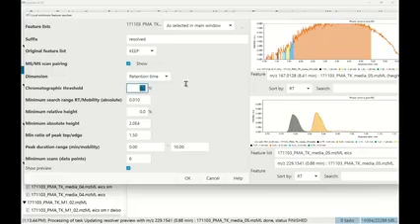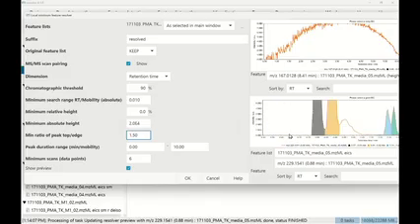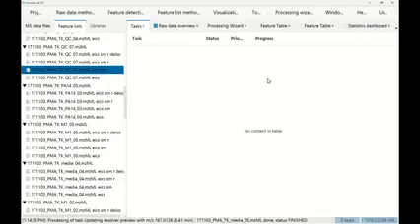And this one I did not optimize, right? So I could very easily now optimize this and basically try to get this shoulder here in, and so on. I can change some parameters and then it automatically changes everything and gives you some feedback. Still never going to be optimal, but in the end, I would say doing statistics, doing molecular networking, and finding something that seems statistically significant in your data set, and then going back to the raw data and visualizing it interactively, I think is the way to go. And then you can focus on, okay, this one seems really interesting and I should spend some time on elucidating the structure or doing everything downstream.